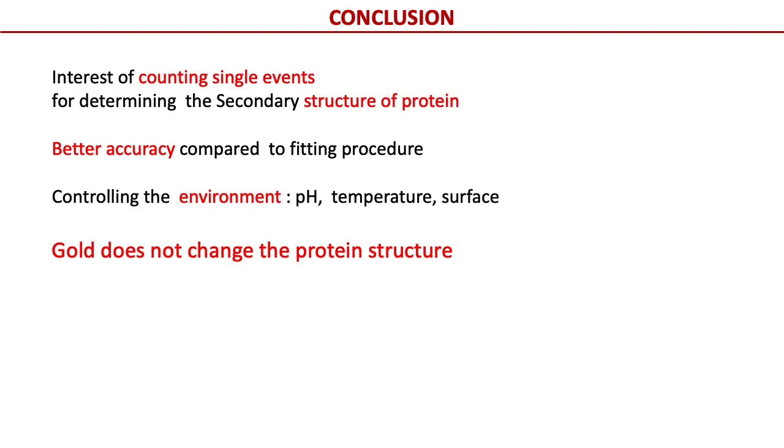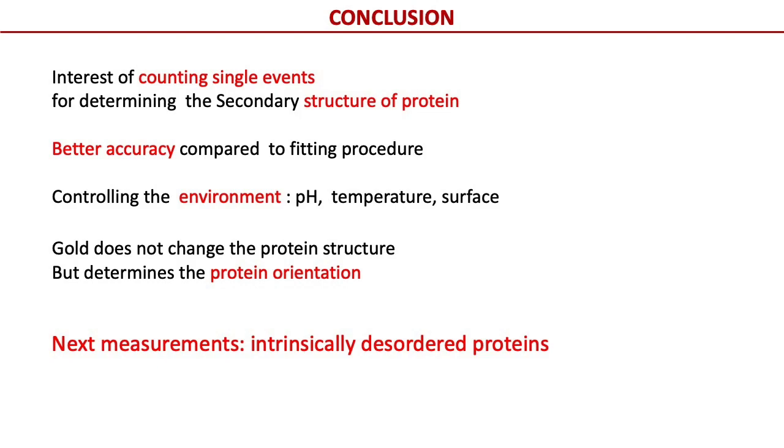We found the gold surface does not impact the secondary structure. However, the electrostatic properties of the surface, thiol group and citrate agent are responsible for the orientation of the protein toward the surface. Perspective of this work is to investigate the naturally disordered protein.